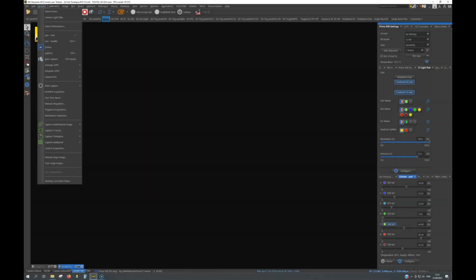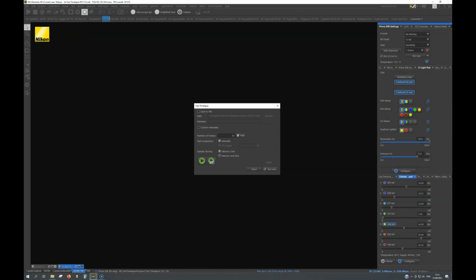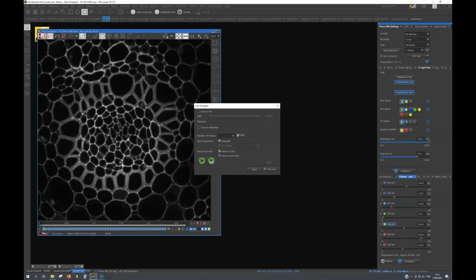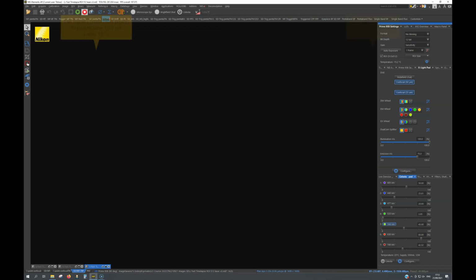We will now acquire 50 images using the same region of interest. The only change we've done to the imaging settings is to increase the laser intensity to 45%. The frame time for an image is the same 5.3 milliseconds as for our previous region of interest image acquisition. But using 3 times the laser power, 45% instead of 15%, has reduced the graininess of the image. To see that, we need to compare the images we have acquired.